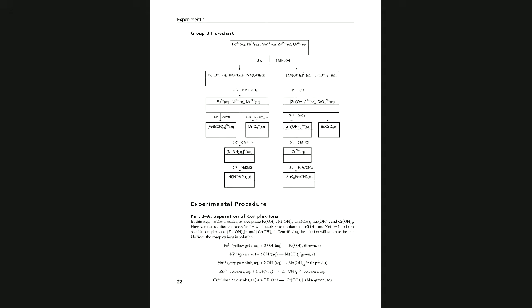So basically the flow chart, I'm going to start with, instead of knowing what we have here, these are X, Y, and Z that I have for the first box, then I'm going to treat my sample like I have all of them, unless it's proven that we don't have it, or we are looking for the evidence that it shows for sure we have that ion.